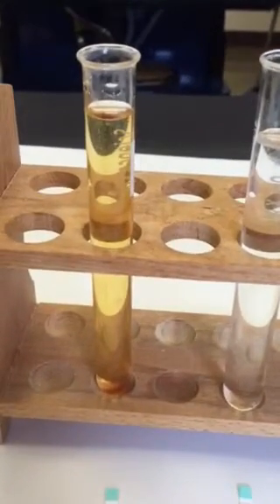The control today is going to be water. So here we see the water in the test tube, and I have the apple juice in this test tube.